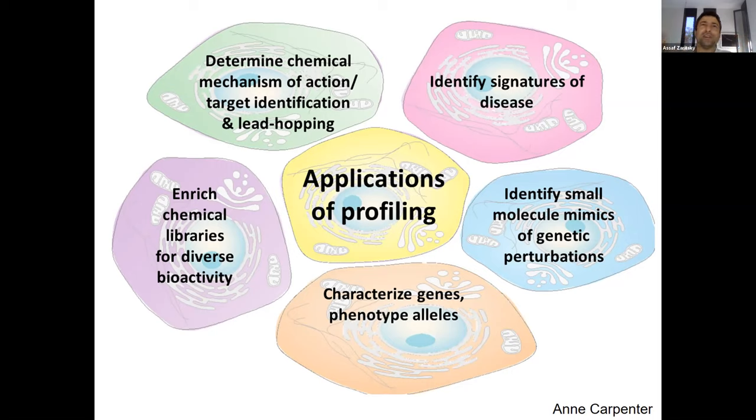Instead of that, there are several known small molecule inhibitors, which are basically chemicals that you put into your media and your cells, and then it inhibits the contractility machinery. So it makes life of thousands, tens of thousands of scientists much easier instead of needing to do the molecular biology. So the idea here is that if we know a target by doing a targeted perturbation, we can then look through a library of small molecules and see if they can produce the same phenotype, then maybe we can get a cheaper solution.